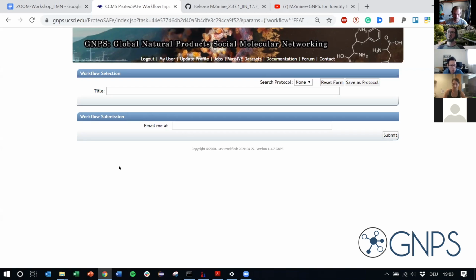You saw that here we had four different files. I should have cloned the job before, but I'm in the German outback with no internet, so it doesn't clone.